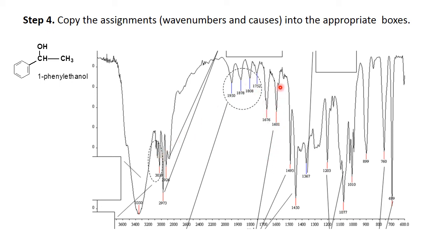1600, 1580, 1500, 1450. Also we have the methyl group absorptions here just below 3000. And again at 1460 would overlap with this 1450 band. Here are the OH bend and the CO stretch. And we have a monosubstitution pattern. So lots for you to identify. And here's the 1380 that's the unique symmetric bend umbrella bend of the methyl group.